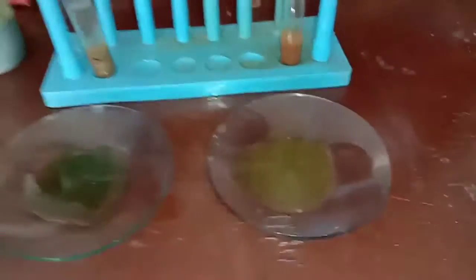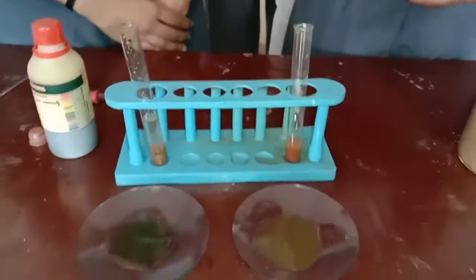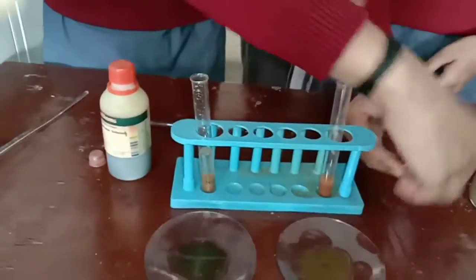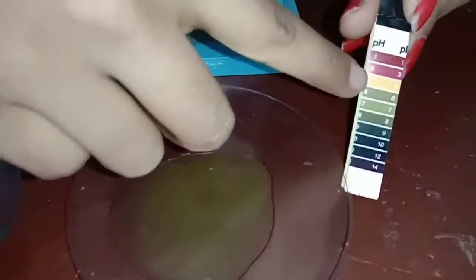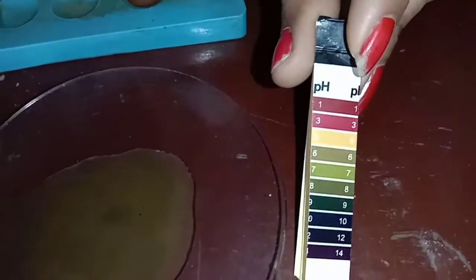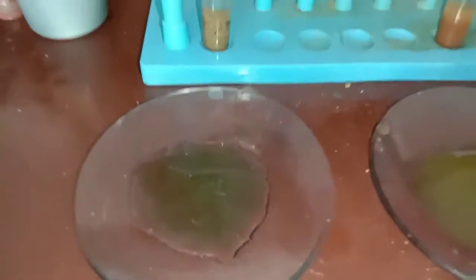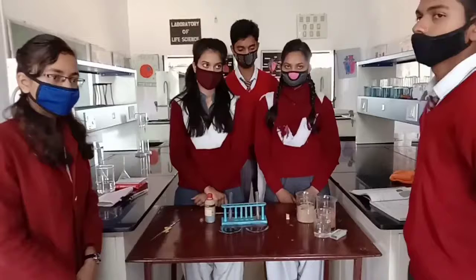Now what we have to do, we'll take the pH strip and try to match the color from this scale, and we'll find the pH of both the samples. So you just match the color of the sample. It is near 7. So you can see here our first soil sample, the clay we have taken from our garden, is having the neutral pH, but the sandy soil we have taken from our school playground, there you can see the pH is near 8. Means it is slightly basic.